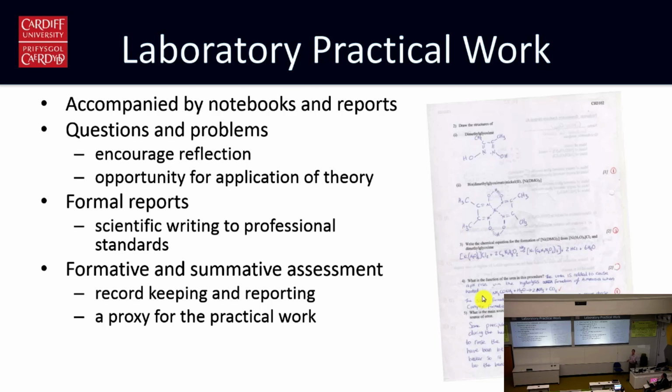The lab reports are also a good opportunity to give students some practice at writing and record keeping to professional standards, for example, as a journal style write-up. The lab reports can also be formatively and summatively assessed. So there's two aspects to this. There's assessing the actual record keeping and reporting and analysis of data.